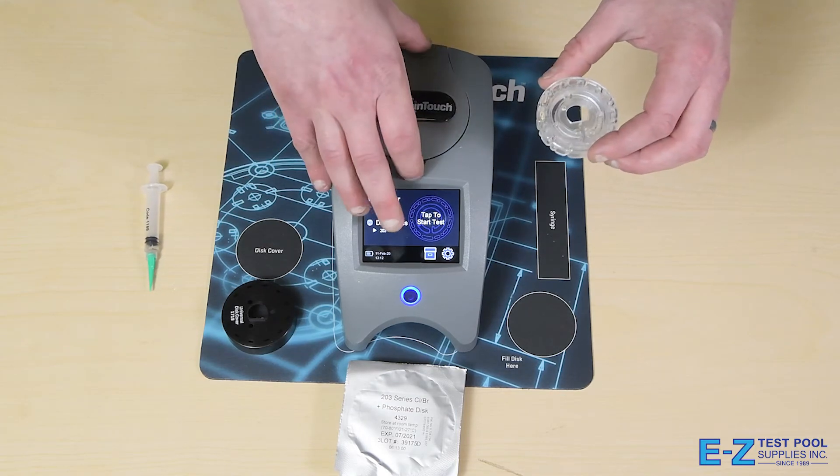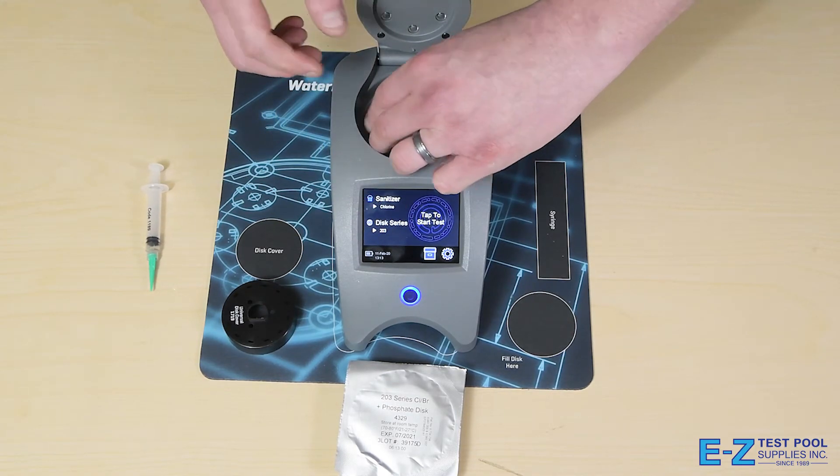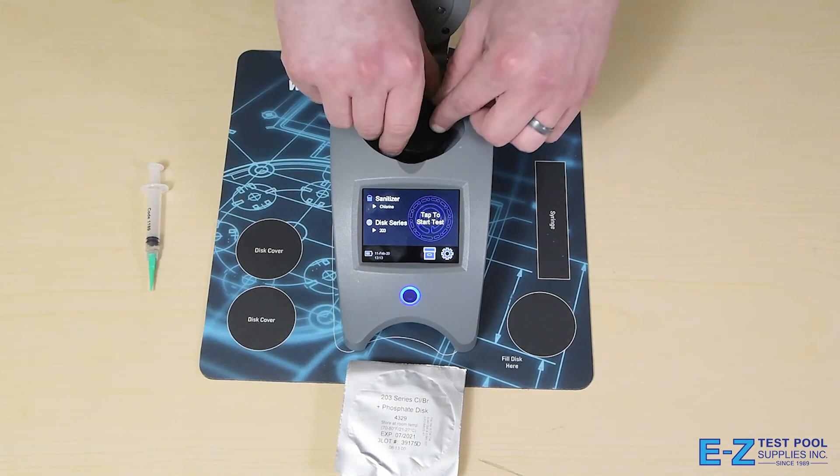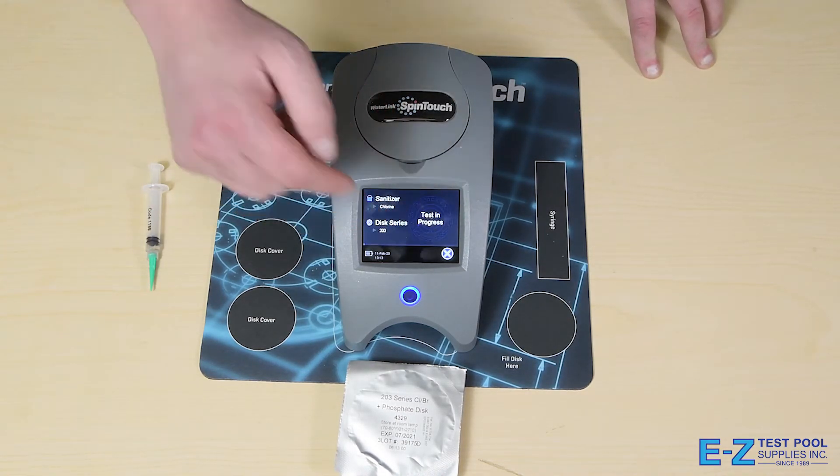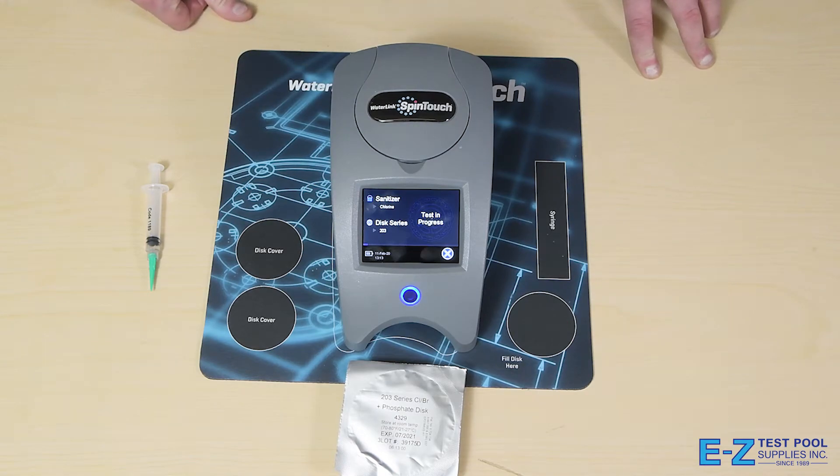Once the disc is filled, we'll place it inside of the machine and cover it up with the provided cover. This is important so that the results are read accurately. At that point, simply press the tap to start button and the test will start. It takes about 60 seconds and will test for 10 different parameters.